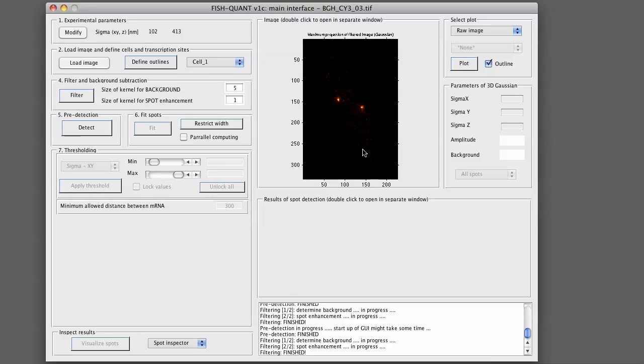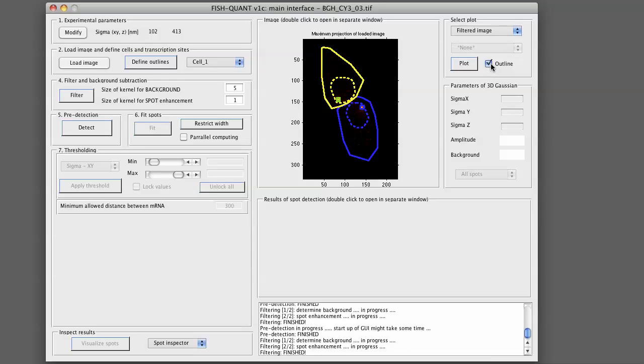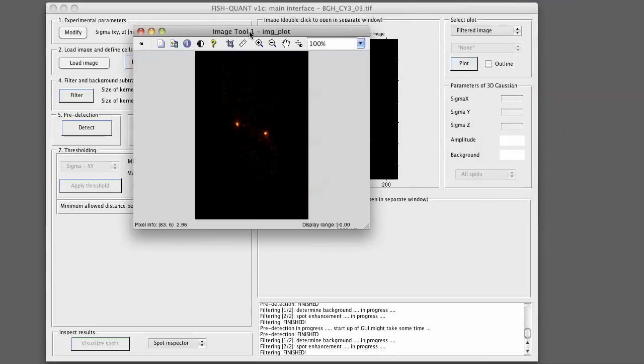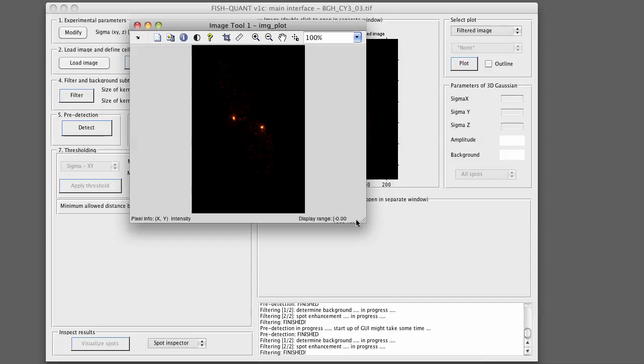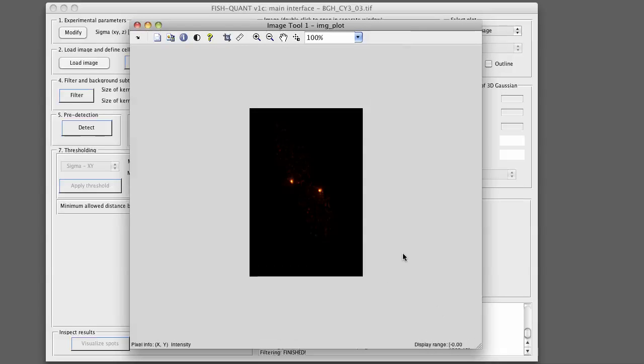We can then look at the filtered image in more detail. In the upper right corner, you can select the filtered image. You can click on Plot. You will see it overlaid with the outlines. You can disable the outlines. Click on Plot again. For a more detailed inspection, you can simply double-click on this image. This will open another window where you now only see this image.